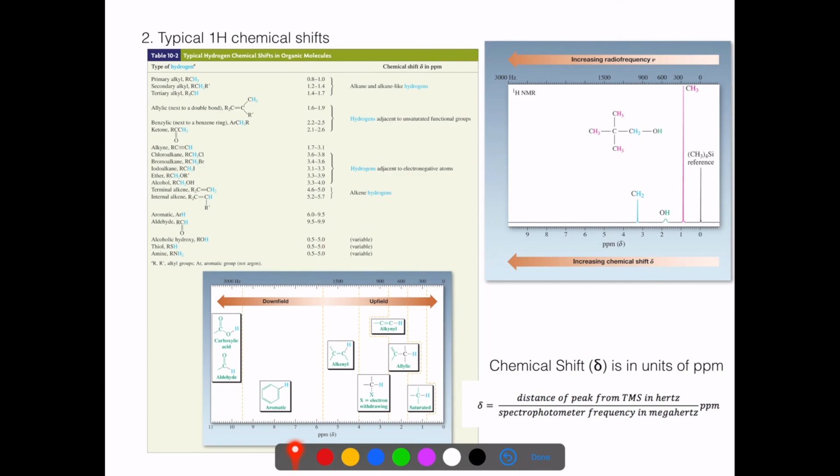All right, so let's bring in our figure again to point out, and this is one we saw at the beginning and now here. And so again, remember we were pointing out the different chemical shifts, so this CH3, right? Remember this is a primary one that comes at about 0.8 to 1. Notice that's exactly where it is. The OH group, all right, so 0.5 to 5, so it has this whole variation. This one's about 1.8 or so. That works. And then you have this CH2. Notice that CH2 is next to an alcohol group, and so it's this one. And so it's in that 3.3 to 4 range, which is just about where we get it. I think I said 3.2 earlier. All right, but nonetheless, these are the chemical shifts.